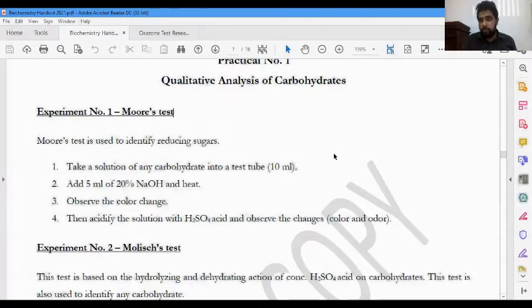Even for sucrose, if we expose it to 180 degrees Celsius, which is a quite high temperature, and keep it for another 5 minutes, sucrose will definitely also caramelize. And caramel has a residual color, usually yellow.